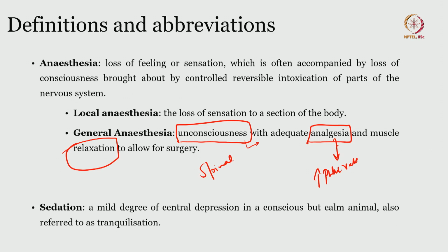So in spinal surgeries, when you expose the spinal column, you will be dissecting a lot of muscles around. So it will be nice and easy to approach the spinal cord if your muscles are relaxed. So that is where the muscle relaxation really matters. For cranial surgeries, not many muscles are there, practically nil on the top of the skull. Alright, it is just skin and subcutaneous tissue, then the pericranium and right through the bone.